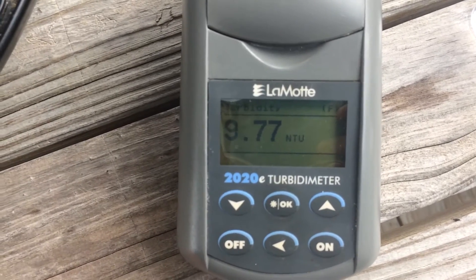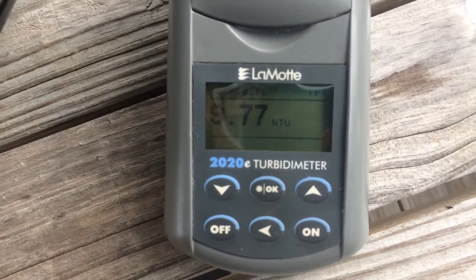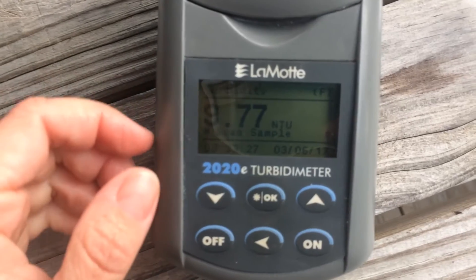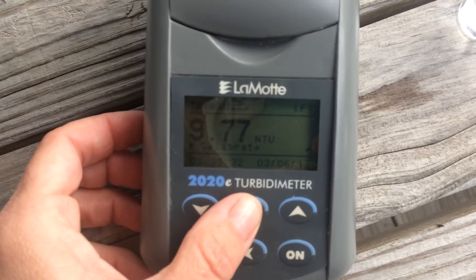It says 9.77, but it's supposed to say ten. So to calibrate it, hit the back arrow one time and wait just a second. When you see scan sample pop up, hit the down arrow, and then when it says calibrate, hit okay.